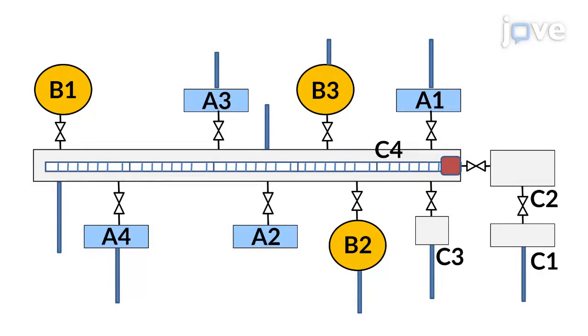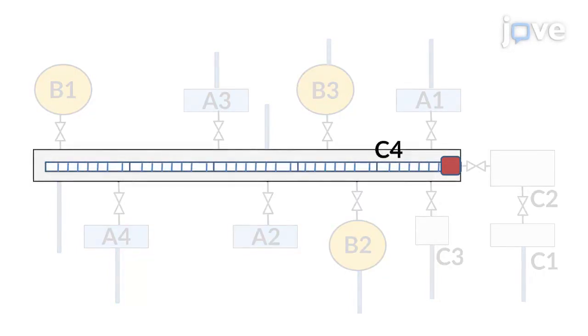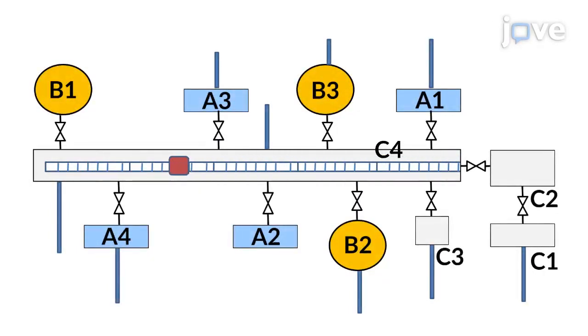When loaded, the sample is on a sample holder and placed on a transport wagon that can move along a linear transport chamber.